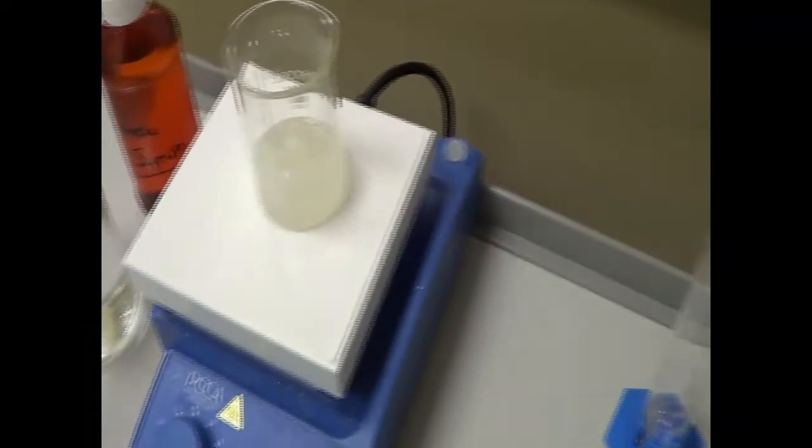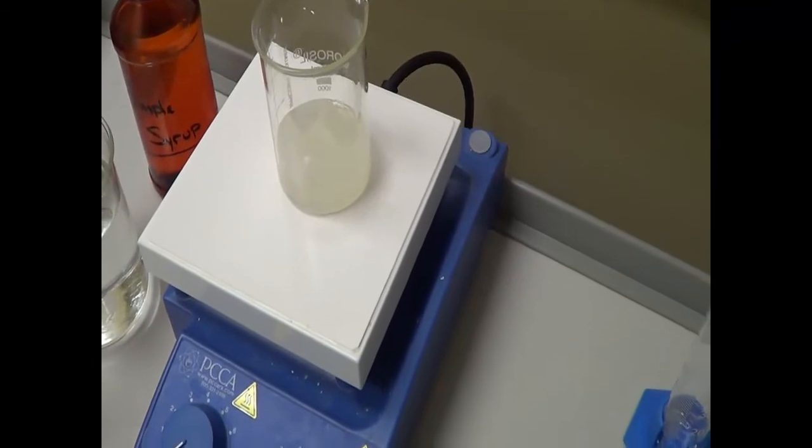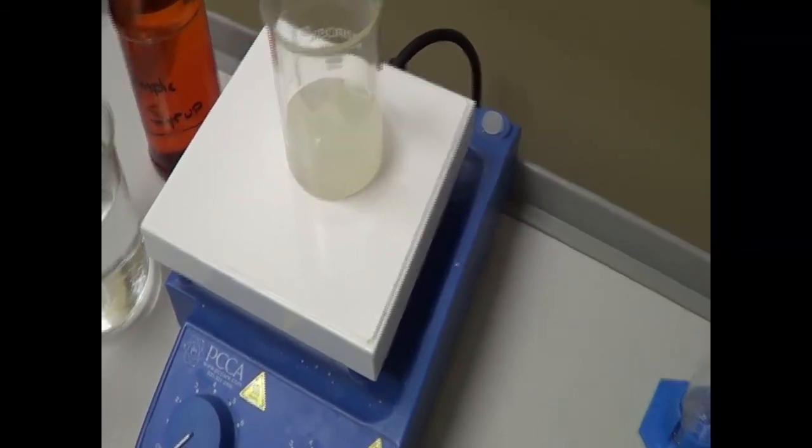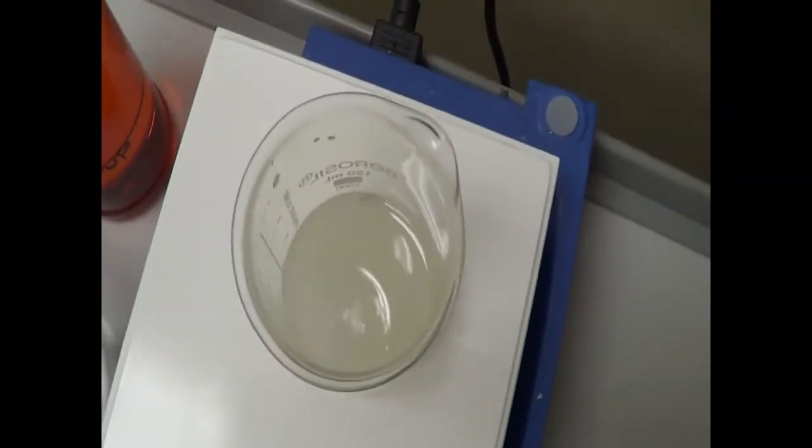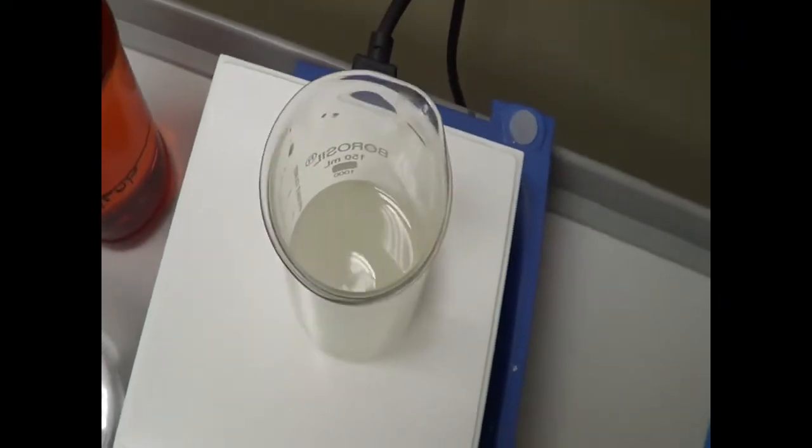After adding glycerin and simple syrup both and stirring, you can see the solution — it is a thick syrupy solution. Now the next step is I am going to turn off the stir.